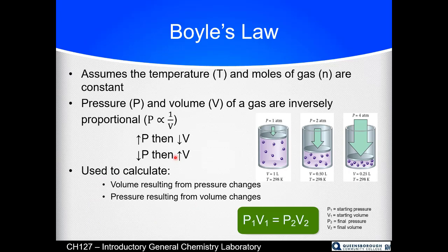Boyle's law, we're looking at pressure versus volume. That is one of the laws that we will explore in this lab. This is the only law that we look at that is an inverse relationship, meaning when one goes up, the other one goes down. When one goes down, the other one goes up.